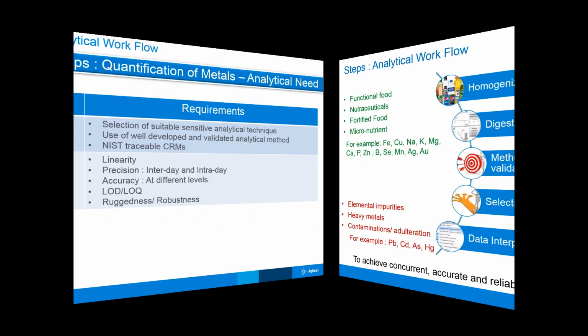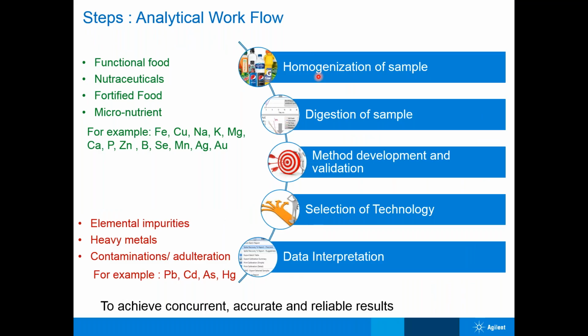So what we have discussed in the analytical workflow: we discussed homogenization, then digestion, method development and validation, selection of technology, and last, data interpretation. Now talking about any technique, the techniques come with software where you can directly interpret the data.